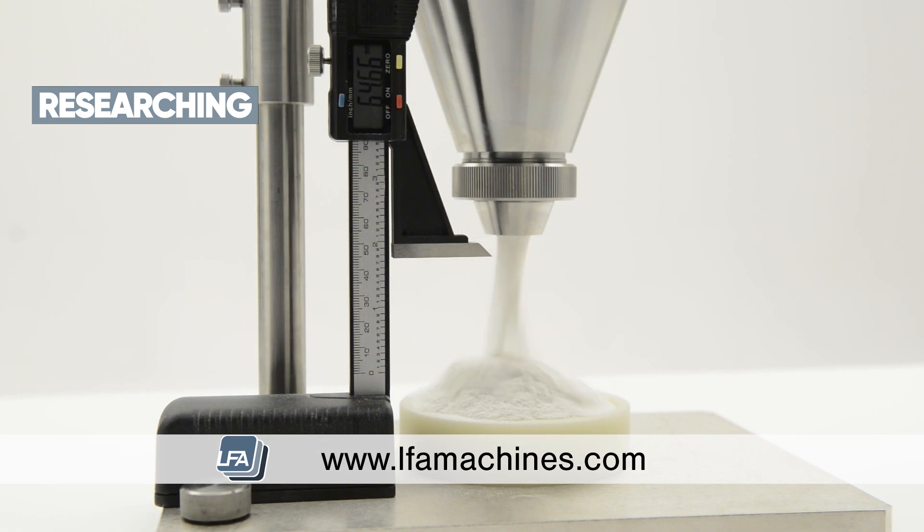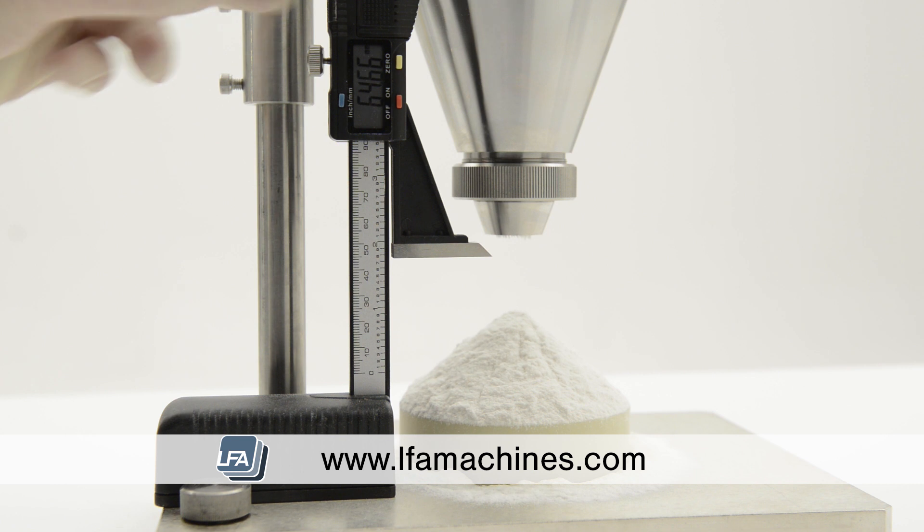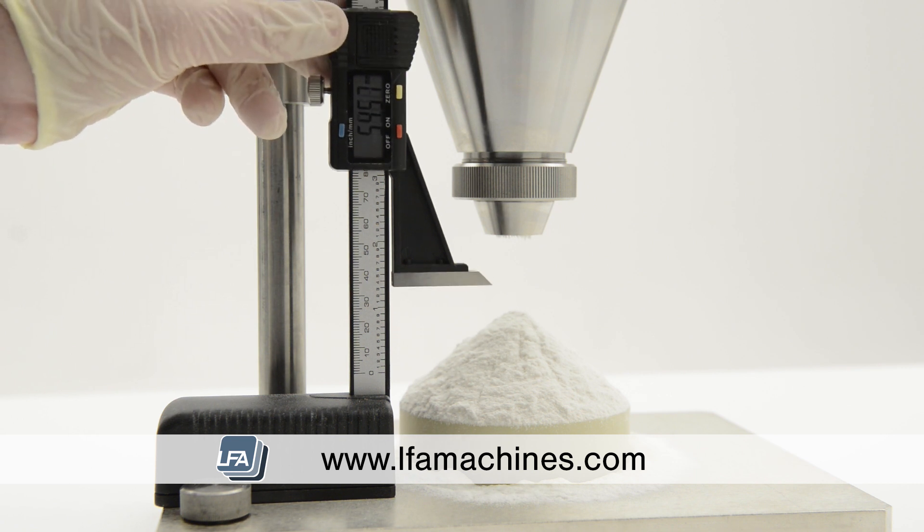This will show the characteristics of a powder before processing and understand the effects from transportation, handling and product storage, allowing you to produce a consistent final product.